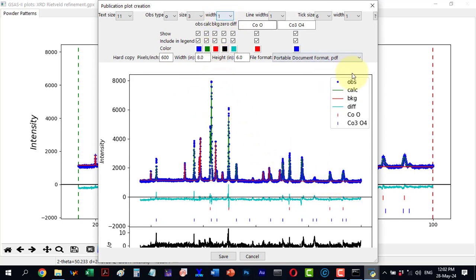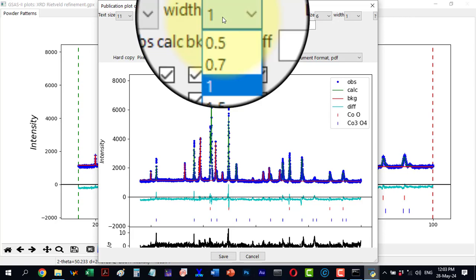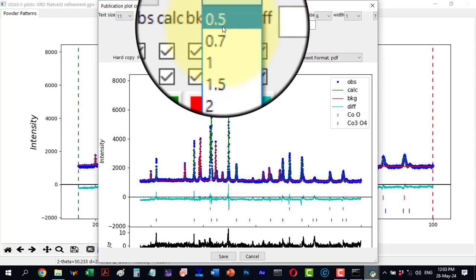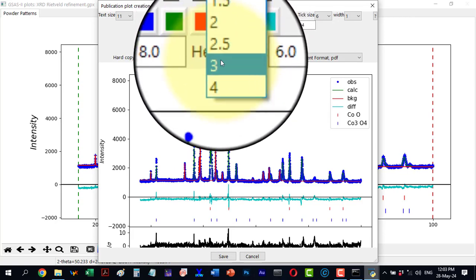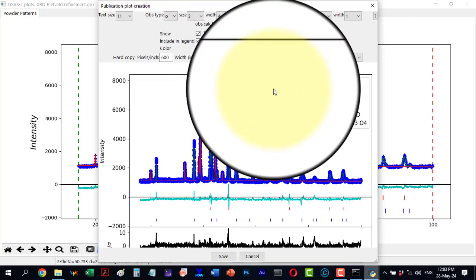Then we have the width of the symbol which is circular. Adjusting the width increases the diameter. I can change the width from a range of options.